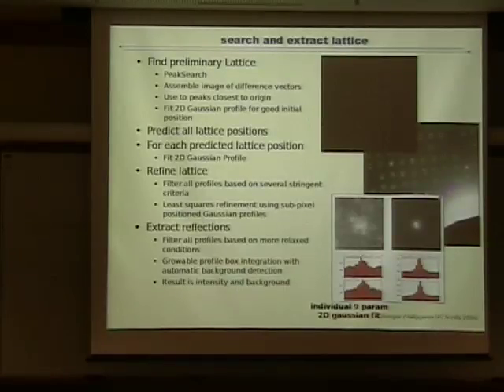Does this work if you have two crystals overlaid? Or does this only work for single crystal diffraction patterns? That depends on what happens here. So we have a pathological case where we really have two lattices that have the same strength. There it doesn't work, because here you might get a mixture of anything. You might find the two closest vectors that are in fact the real A vectors, and then the program uses that. So it could work or it could not work.